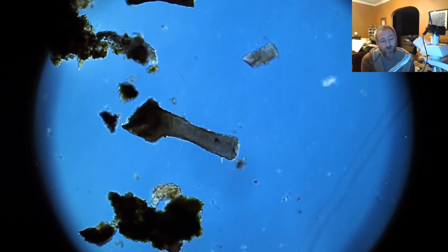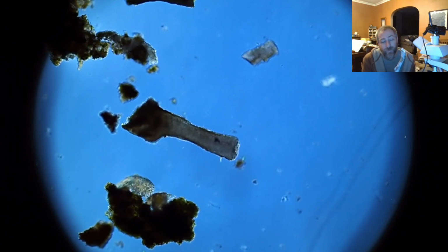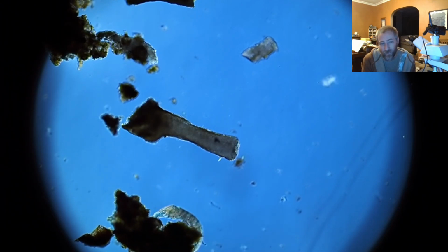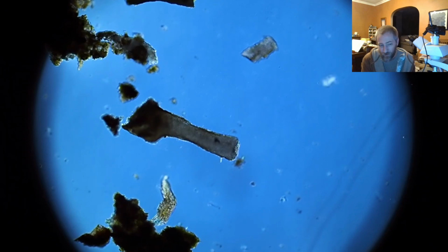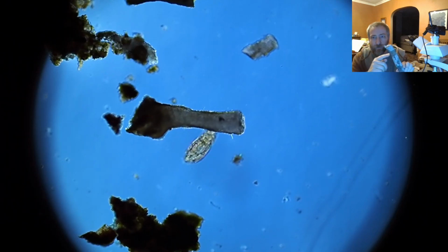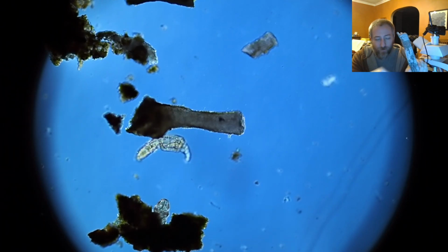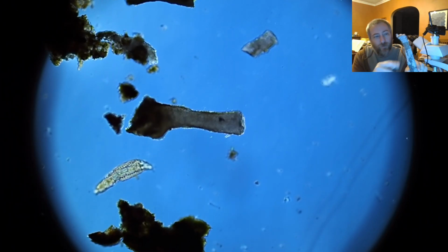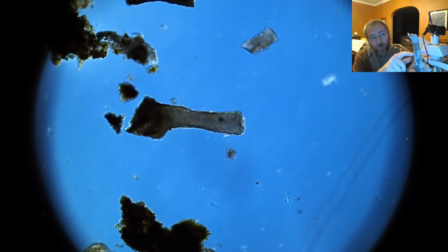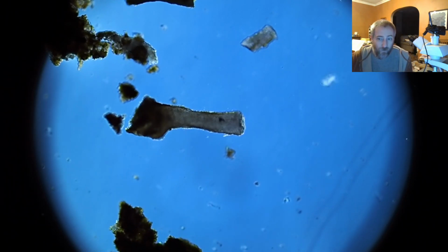I think once I started looking for old sticks with a little bit of lichen on them that had fallen off of the trees, I've been able to find pretty much every stick that I've looked at has had water bears and rotifers and nematode worms in them. And all I did for these is I just took a little paring knife, and you can see the little sort of part that I scraped off. That's not for the sample that we're looking at. The sample that we're looking at is actually from a stick that's over there on my couch. But I just scraped a little bit of the lichen part off into a little glass bowl, and then I added some water. And I think it's really critical.